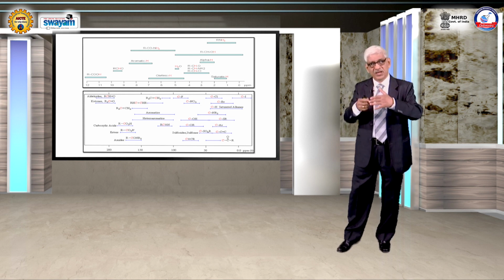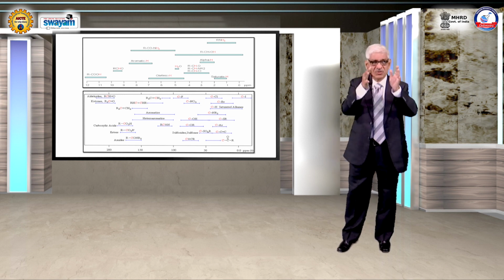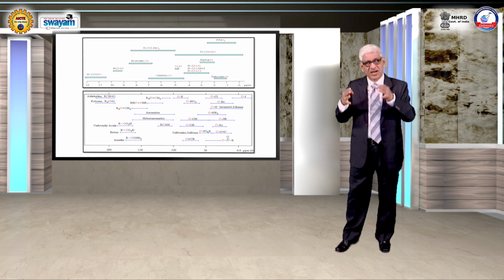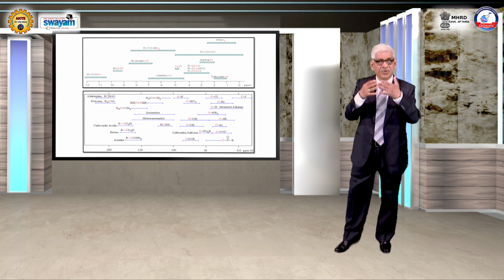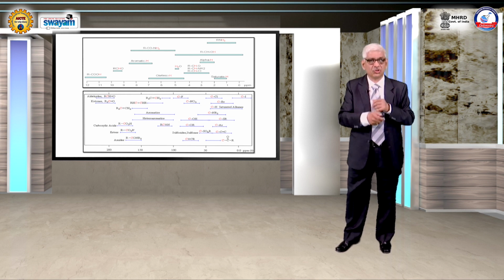The delta number is now represented as ppm, parts per million, because you remember there was nu I minus nu r divided by nu naught. So this is actually in ppm, because nu naught is in megahertz and nu I minus nu r is in the small kilohertz range, and therefore this can be a parts per million. Typically in a proton, these ppms go from 0 to 12 ppm.